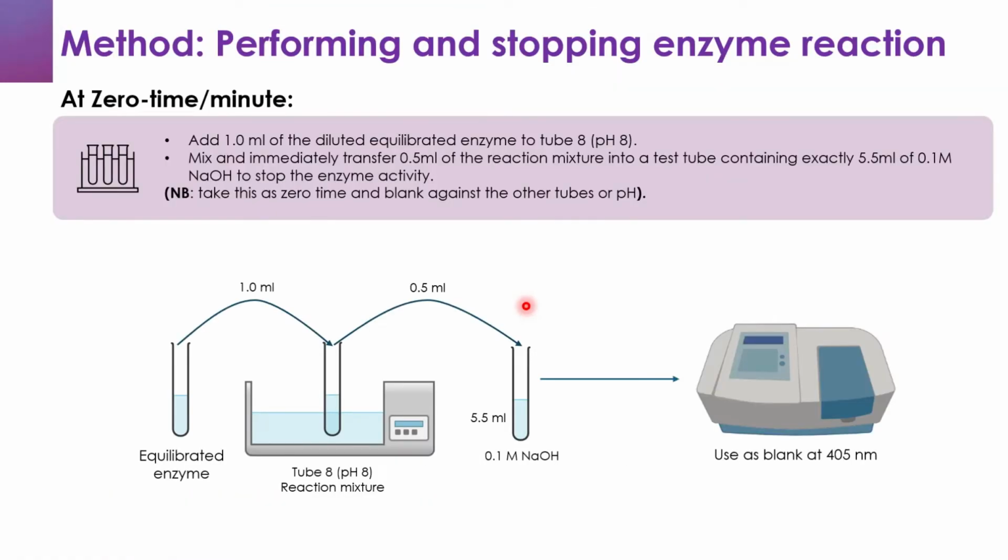So now let's see how to perform and stop our reaction mixture. And we are going to do this at 0 time or 0 minutes and at 30 minutes after we prepare our reaction mixture. So let's start by looking at 0 time or 0 minutes.